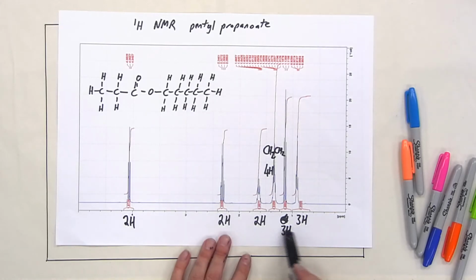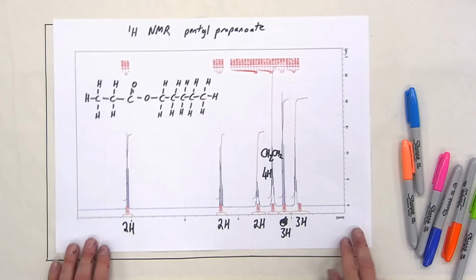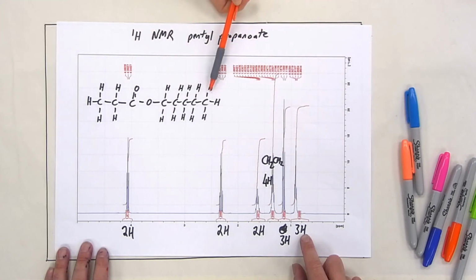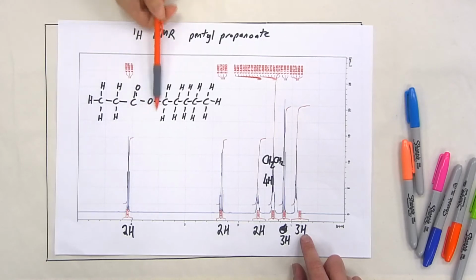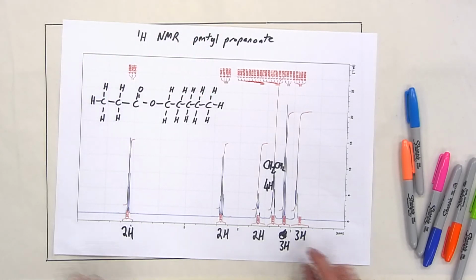Okay, so what are we going to say a little bit more about? Oh, the CH3s. Which ones might be which? Yeah, so you've got 2 CH3s at the end. There's a CH3 here, there's a CH3 here, so at either end of the molecule there's a CH3. And I guess we can possibly guess which one's which. So Eleanor, which one do you reckon is the one with the lower chemical shift? I am thinking it's going to be this one. Yeah. Because this one is slightly closer to the electronegative oxygens here, so we would expect this one to be slightly more de-shielded than the methyl group down here. Yep, absolutely. I agree. Perfect.